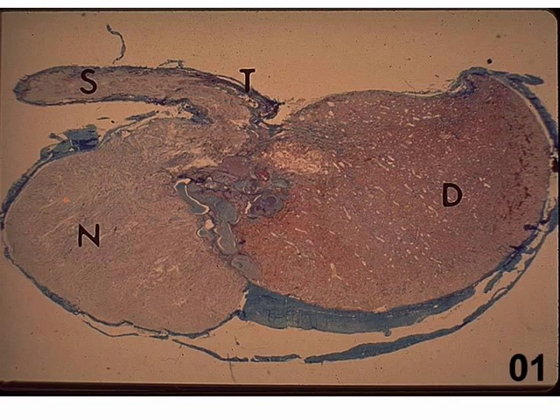The first slide is a very low magnification image of the entire pituitary section of the pituitary, which was from a cadaver. As you can see from the labeling, there are several parts to the pituitary.